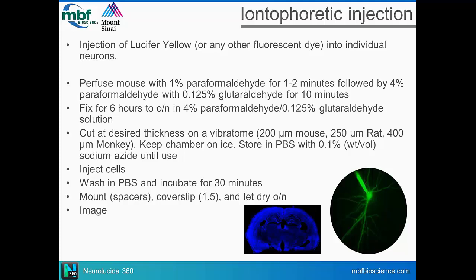And then we keep this in PBS with azide, and we found that if you do this, you can come back to these sections for years and years after you load your cells. Another important thing, in any situation when you are mounting your cells on your slides, we use spacers that you can get from EMS or Fisher Scientific.